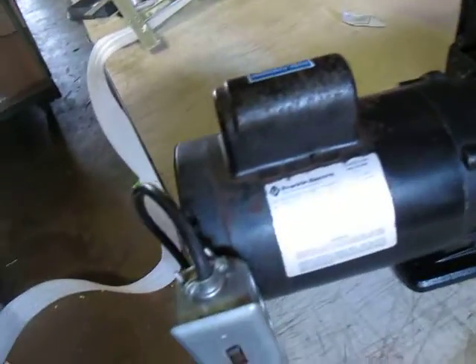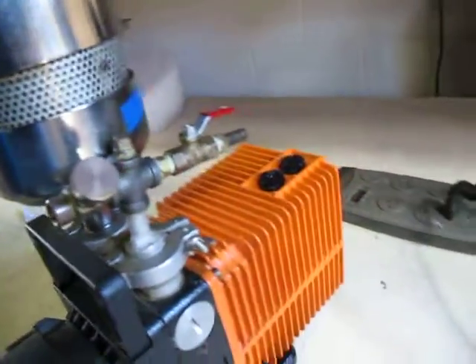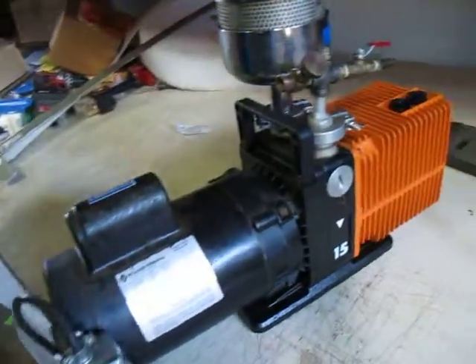It's a 115 volt motor, three-quarter horse. It's got a filter on it. It does have suction — tested that right here. Seems to work as it should.